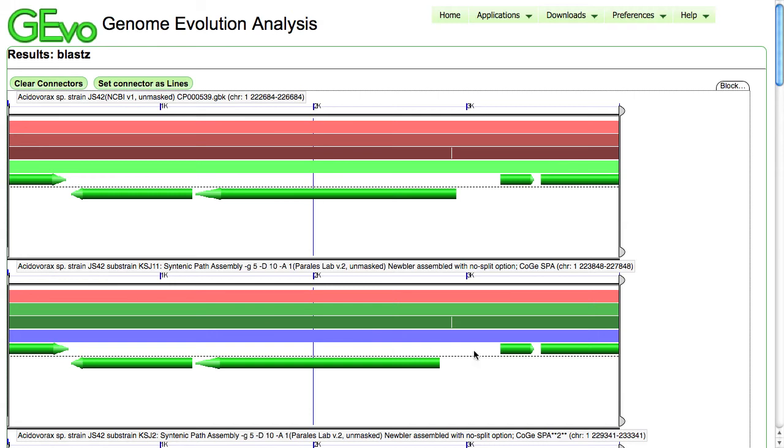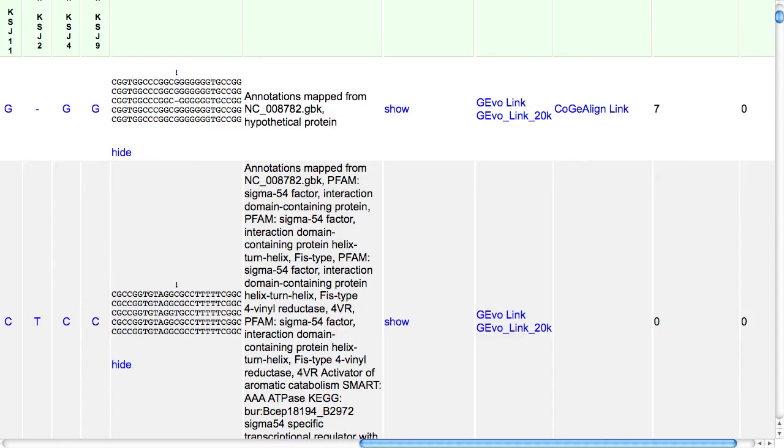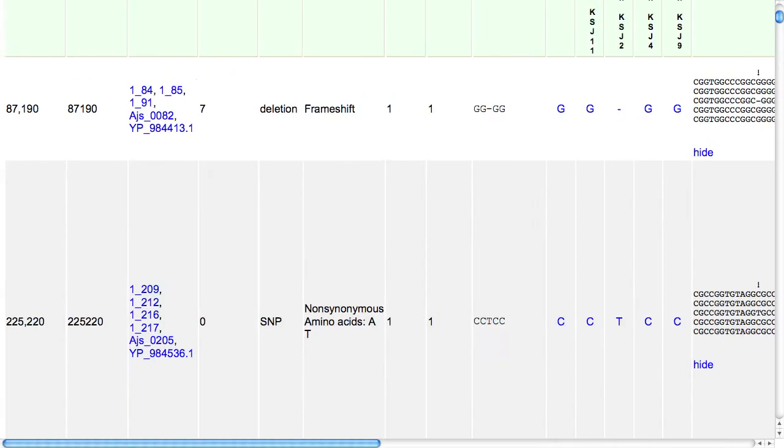So I would count this one as likely, and one that's probably worth following up with additional experiments. So particularly to clone and sequence this region, see if it really is real, and if it is, then move it into some genetic experiments. So next I want to show you one that has a couple of problems.